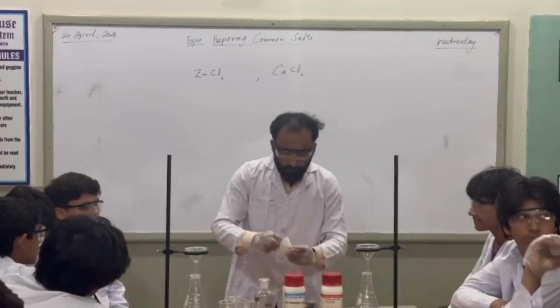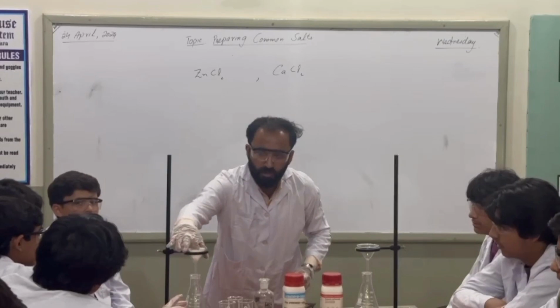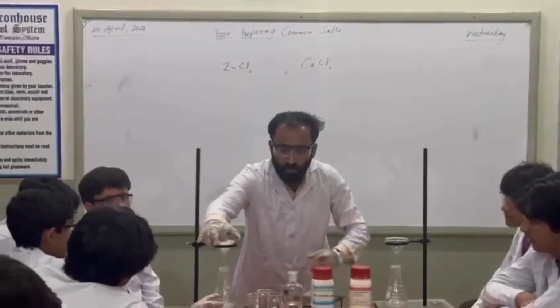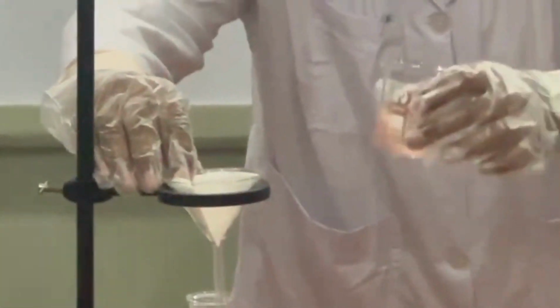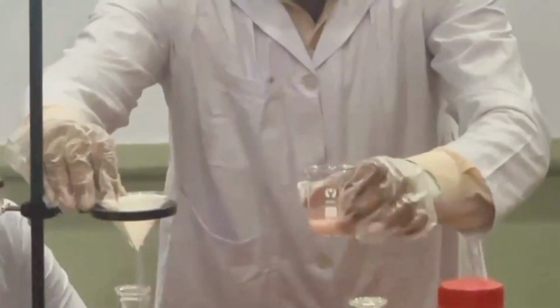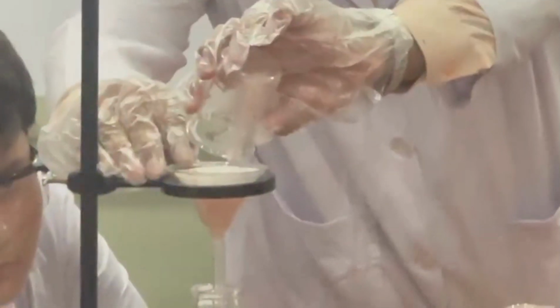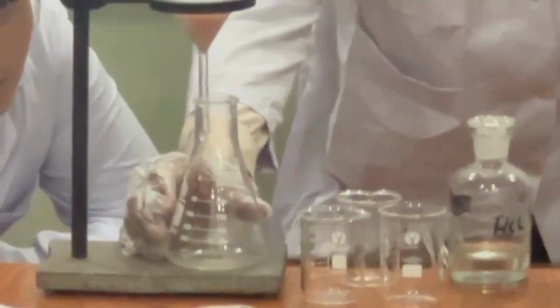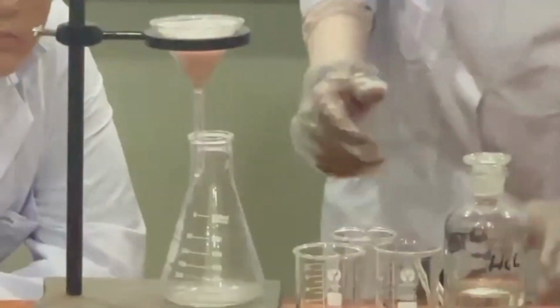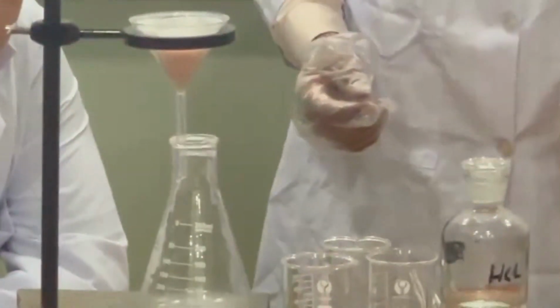First we will use the simple one. Why are you using this one? Because we have to observe the difference. Okay, now I would like to pour the solution. The solution will filter out. Wait for the filtration to take place. But how much time can this take? It may take 2 to 3 minutes. Hours? No, it's too much time.